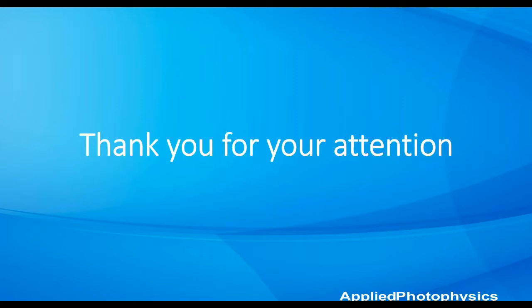Thank you. I think that clarifies that important point. Another viewer writes in, how important is the choice of using WSD compared to other analyses? Do you ultimately get a different result or conclusion by using different ways to reduce the spectra? Yeah, that's a very, very good question. I've spent a very long time looking into that. I would encourage you to look at a couple of papers that I cited in here. The first is the Tesca article, and the second is Dinh, D-I-N-H.